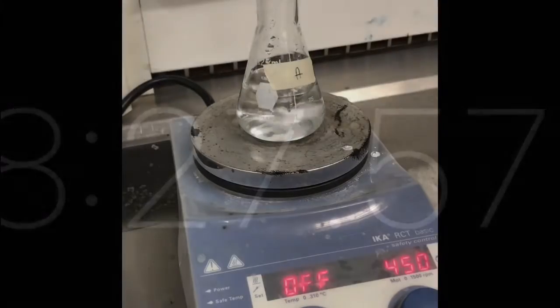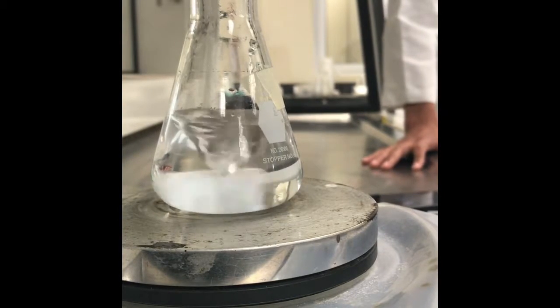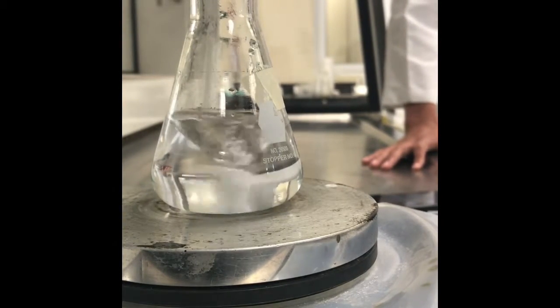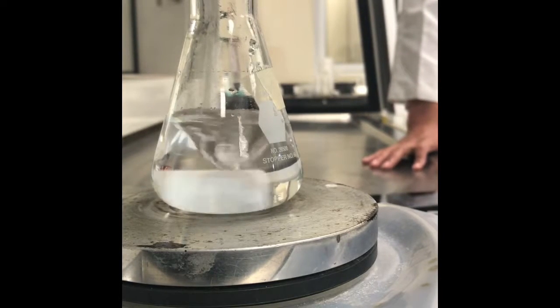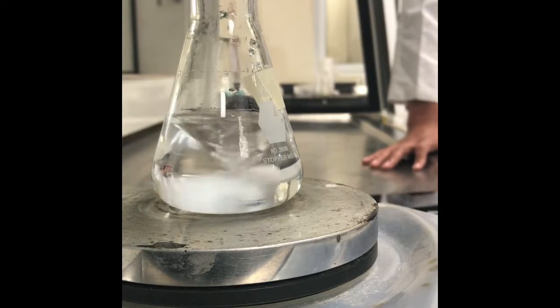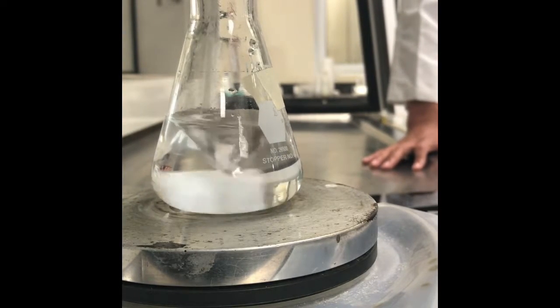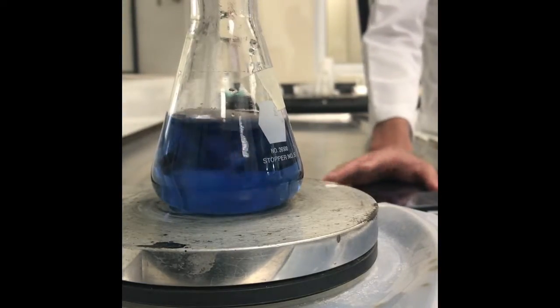In the first practice, we could do the experiment 1 and 2, and we could analyze the time and the reactions with time, velocity, and movement. The first part of the practice was quite impressive because we could physically observe when the substance reached its chemical balance. It was necessary to agitate the mixture with a stirring device for an average of 5 to 15 minutes depending on the reaction, and we could observe the change of color.